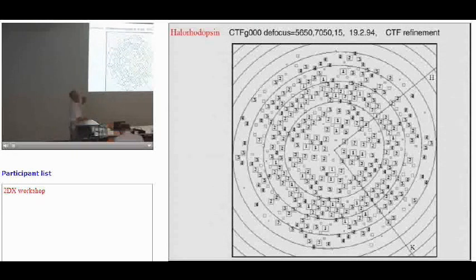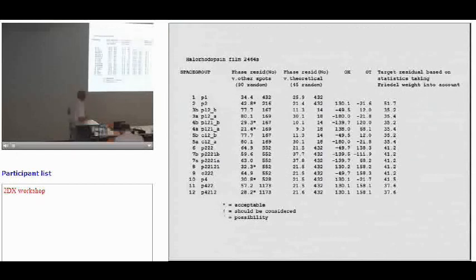They've been already corrected for the CTF by looking at the zeros in the transform and refining it, possibly starting with CTF tilt, CTFFIND first, and then refining using CTF search or something like that. But anyway, you then get out a list of amplitudes and phases corrected for the symmetry, and you then ask what is the space group, and then you run Allspace, and Allspace should only be run on untilted pictures. Otherwise, it'll work, but it'll just give you random numbers.